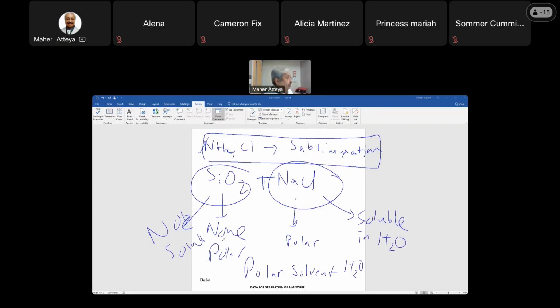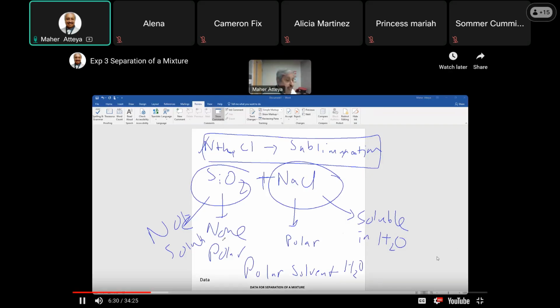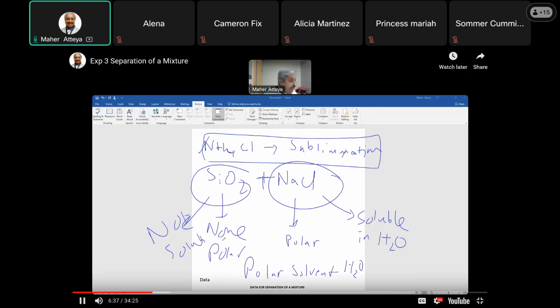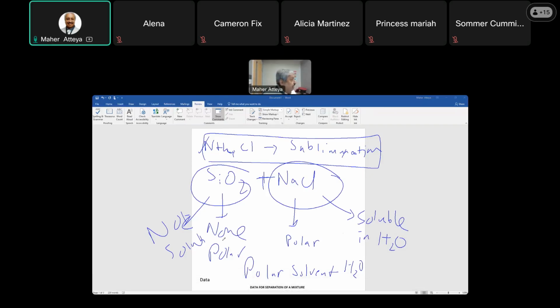Then we separate both of those: the sodium chloride aqueous solution, and the sand, which is wet a little bit. So we will heat to dryness to evaporate all leftover H2O inside those two crystal solids. We'll have then sand by itself and sodium chloride by itself. Go and make some weighing and calculation, and then we can see the recovery of the three components.